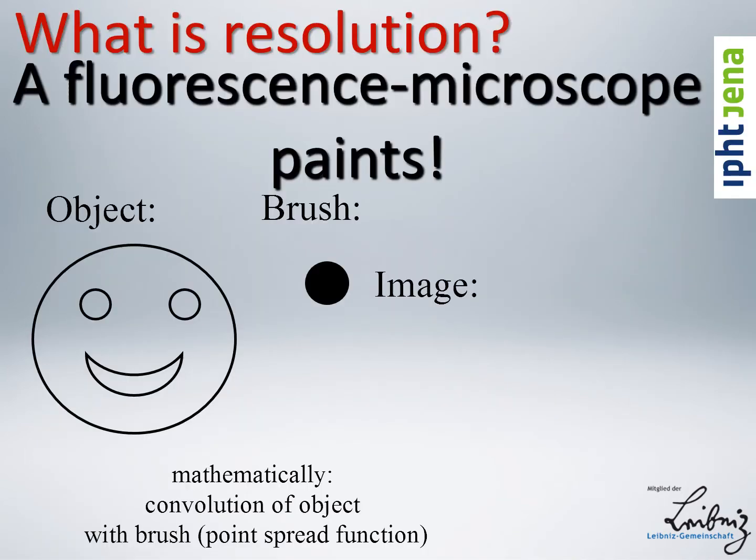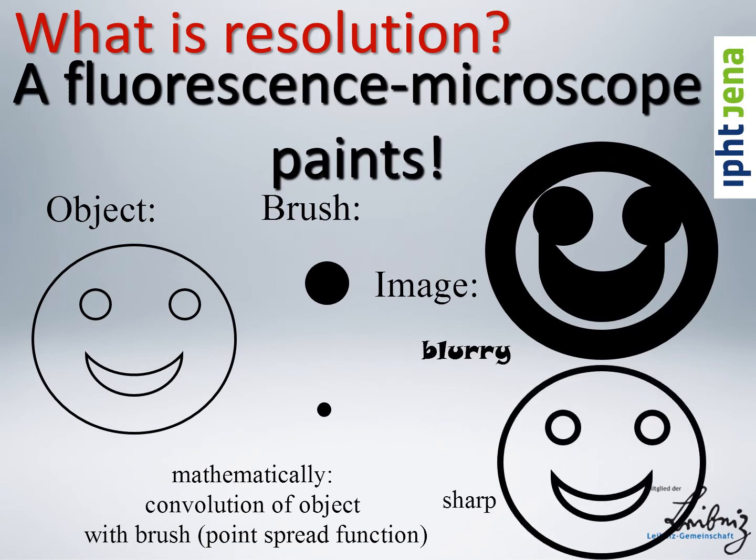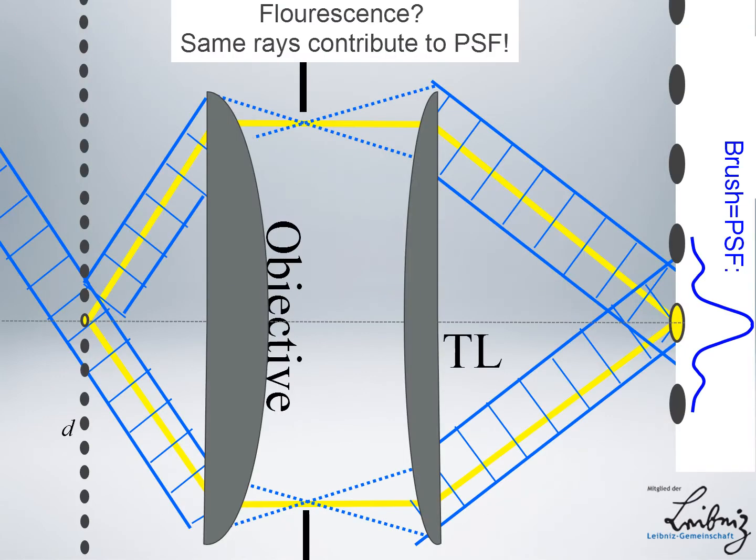So here, remember again this convolution phenomenon that we had before. Painting with a brush, convolution describes microscopic imaging. This is particularly true for these microscope systems that are designed according to the Abbe sine condition. So now you might say, well, this is all fine, but what the heck has Abbe's analysis of transmitted light microscopy to do with fluorescence microscopy?